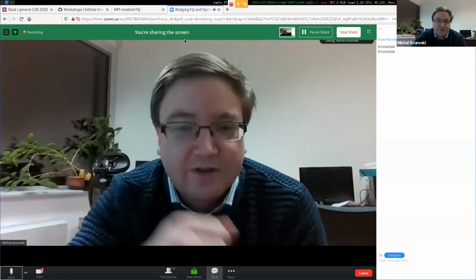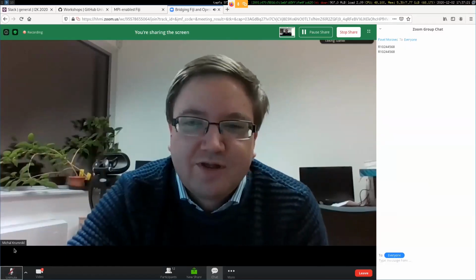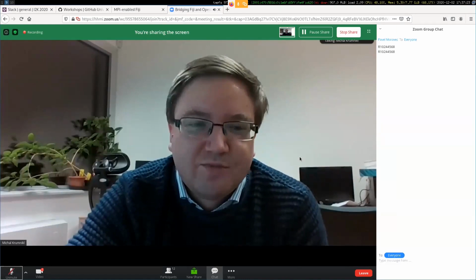Okay, so during the time, Stefanos has also prepared example how to run it into that HPC Workflow Manager. So basically, we will show you the other option that we have there. And after that, I will summarize both of them. So I will just ask Stefanos to run it quickly, just basically skip that not interesting part or part that we have covered several times, and just let's see how to run it, and then let's put it together.